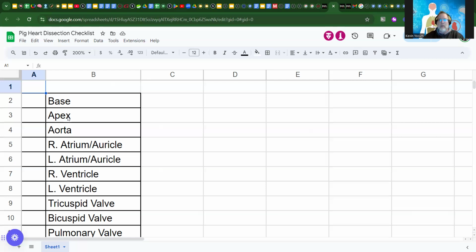So those are a couple of ways. We want to look at the front of the heart, or the anterior aspect, initially, and then we want the point, or the apex, facing us. So we'll keep that. And of course, I've got the slideshow. I know it may seem kind of putsy at the moment, but it won't be next week.